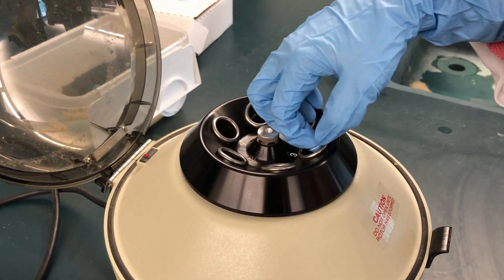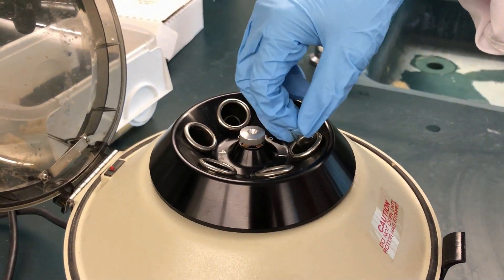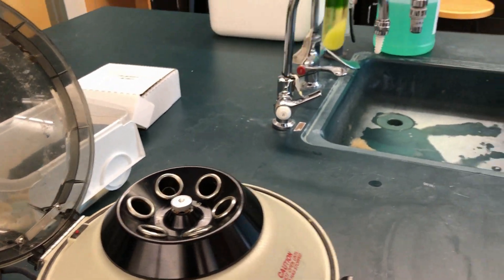After the centrifuge stops completely, carefully remove your test tube. You should see the layers with the petroleum ether and the pigments on the top layer.